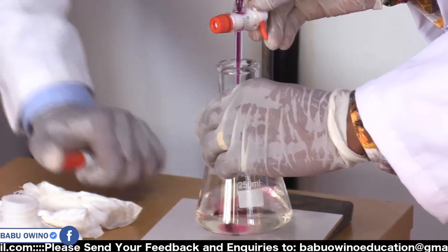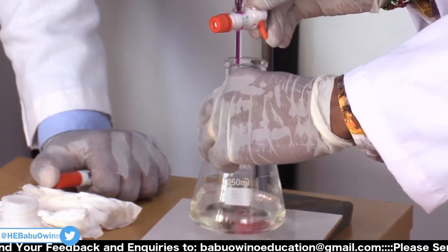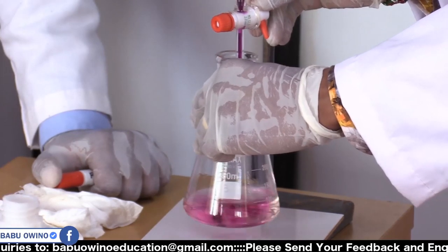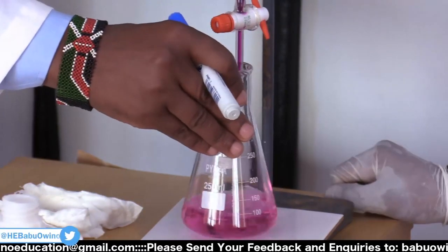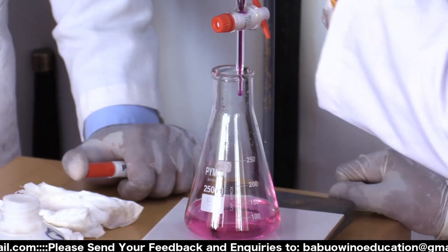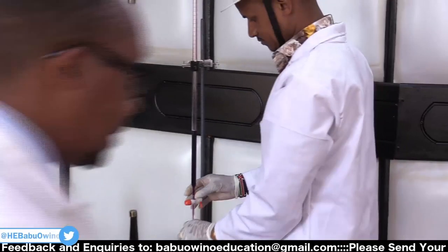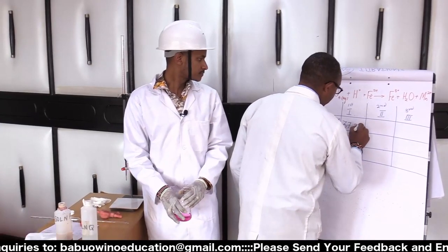Just shake. Shake until it changes. You can see it has not changed. You continue, you don't panic. You have added a lot, but forget it. So that's 37.3. Don't panic. Just 37.3.